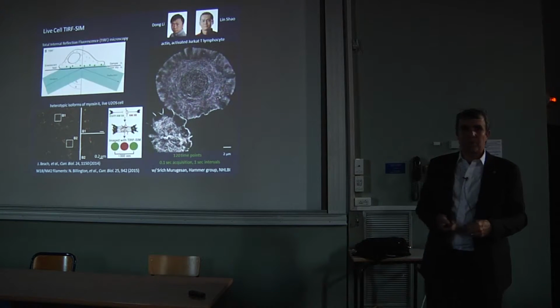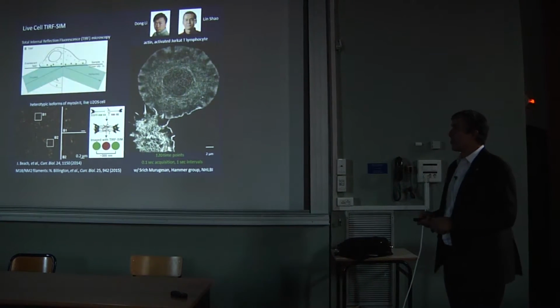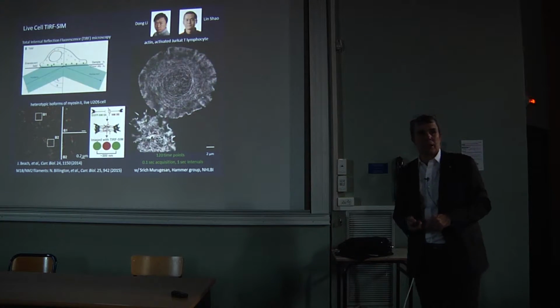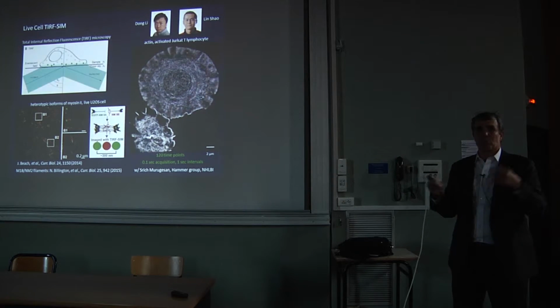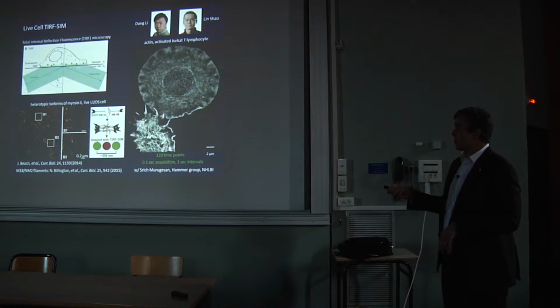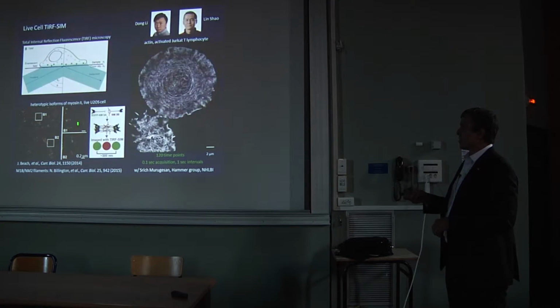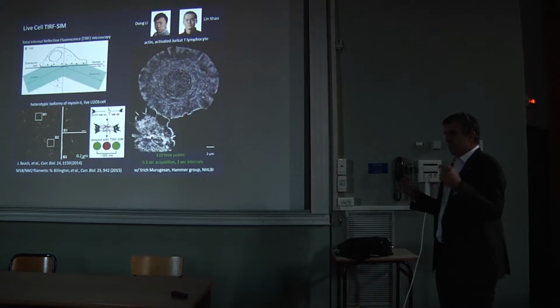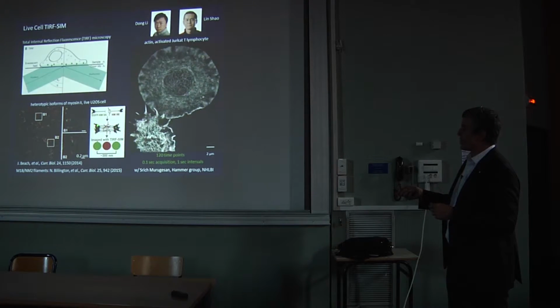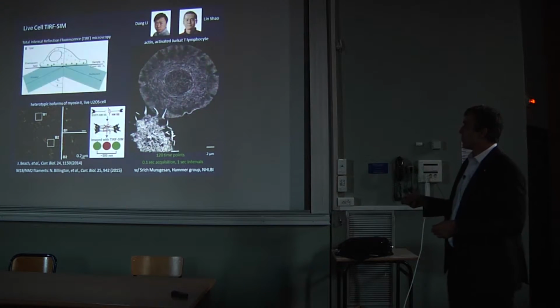But the method that's probably been most used by our collaborators with SIM is to do it in TIRF, where you use an evanescent field to only illuminate the bottom of the cell. Not only does this reduce the excitation and the damage to the rest of the specimen, it creates very high SNR for SIM and makes it easy to do. So we've used that to study how myosin 2, a motor protein, ends up bundling together in these bipolar filaments and how different types of myosin 2s come together.